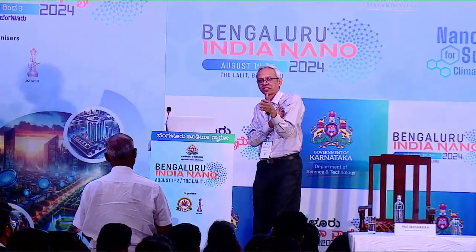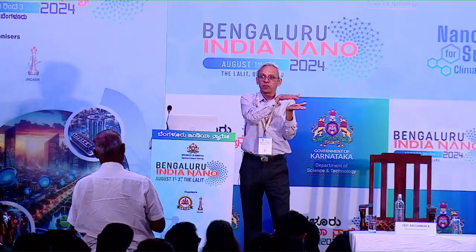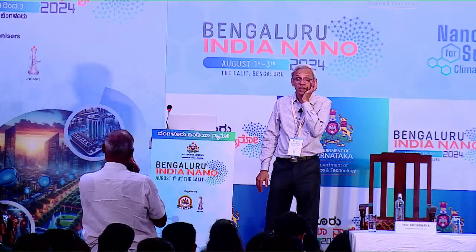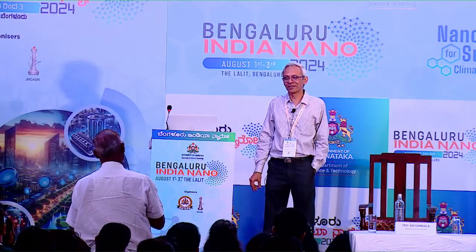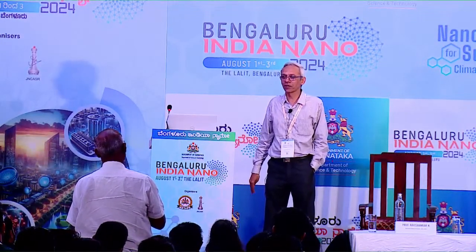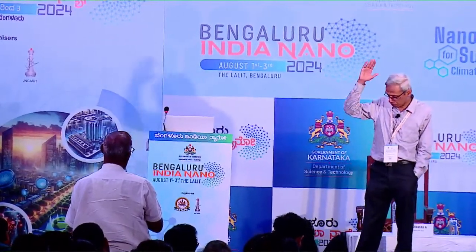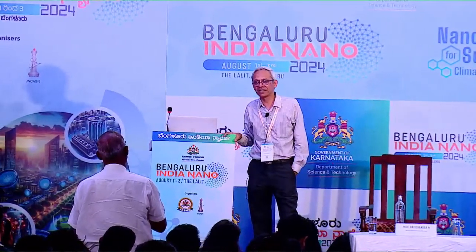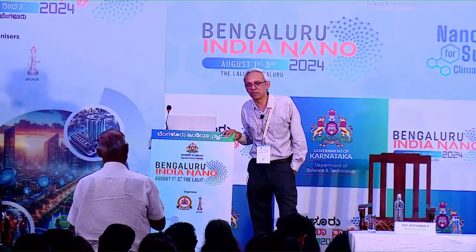First of all, because of the kind of temperatures that you have there, what we can put inside the microscope are thin materials. I can understand the limitations of this. Apart from this, what other technology is available in the world? I'm not an expert in those things, so you're better off asking somebody else. For a thermonuclear reaction, I'm not very sure what would be the best technique. At those kinds of temperatures, which are several powers of ten degrees, I don't know what level of characterization can be done. So it's not an easy problem.